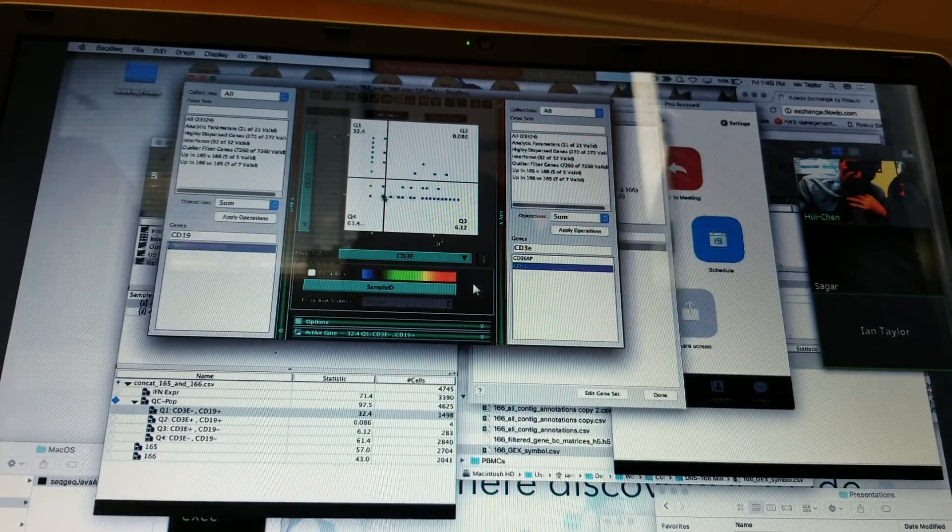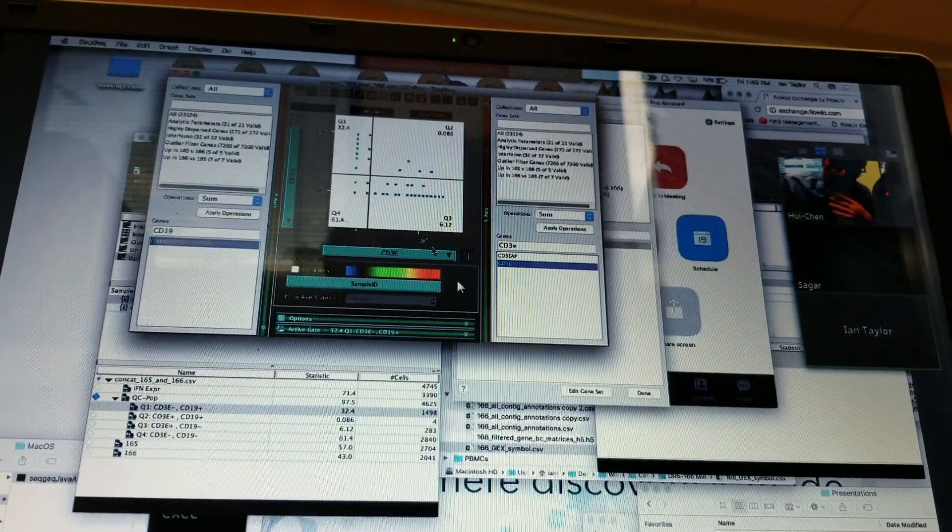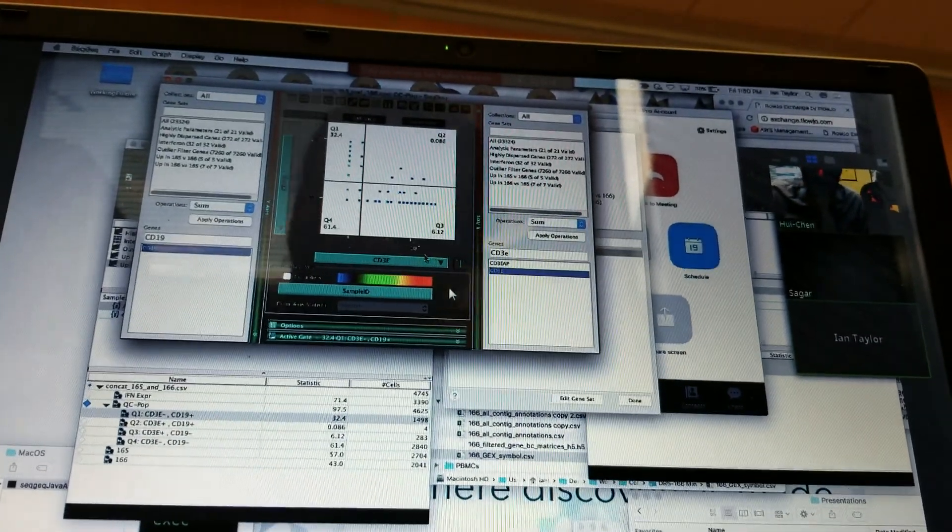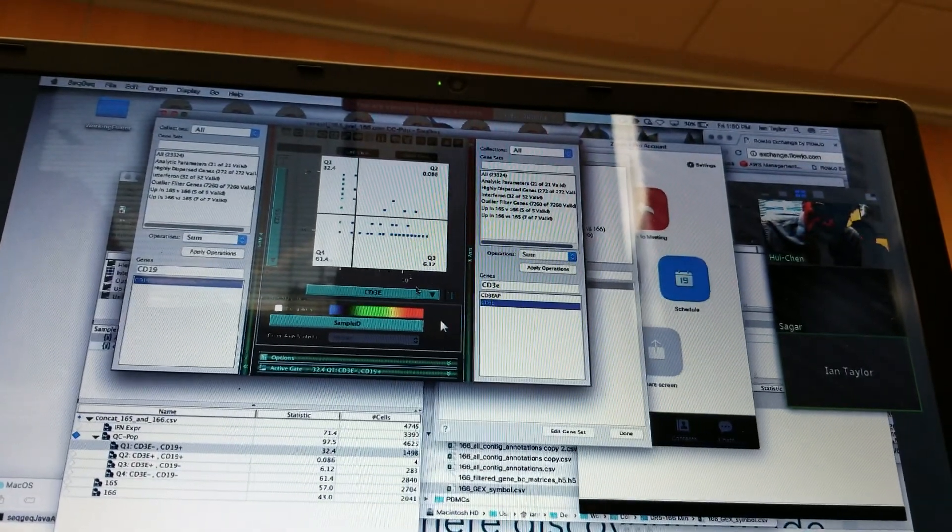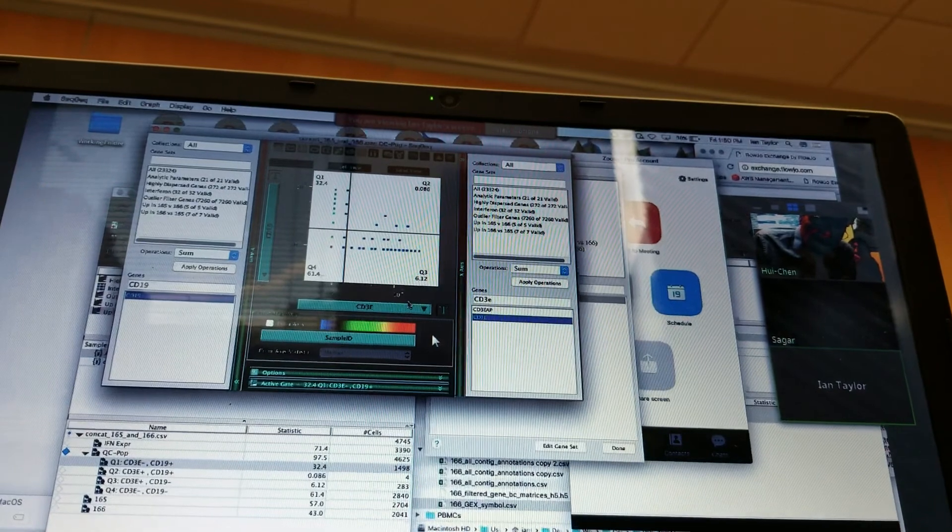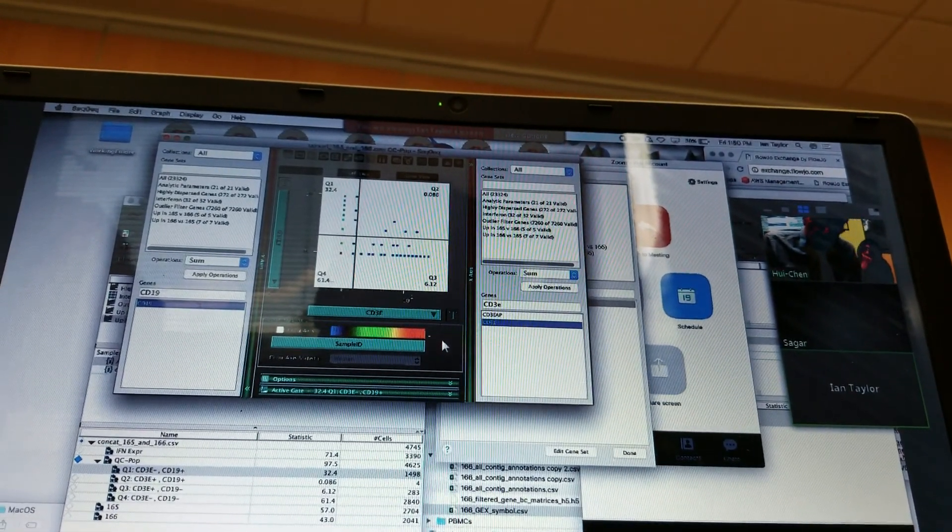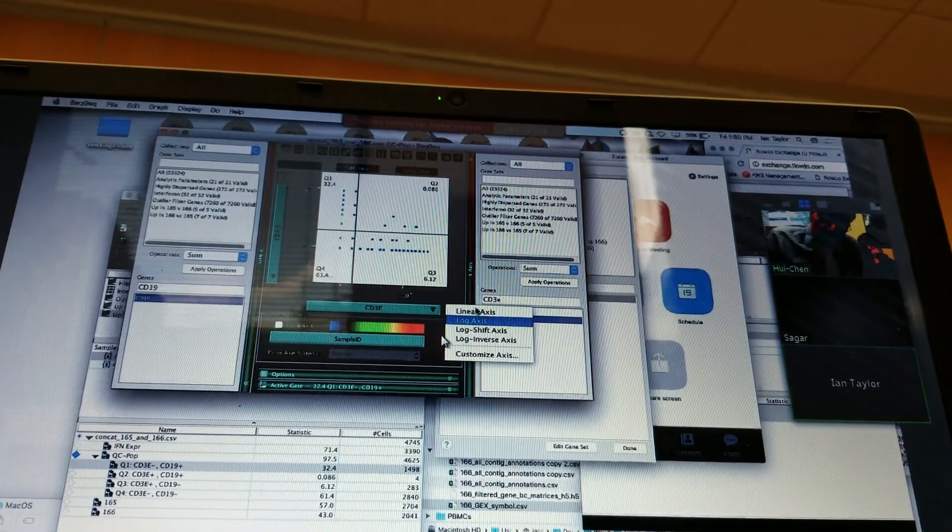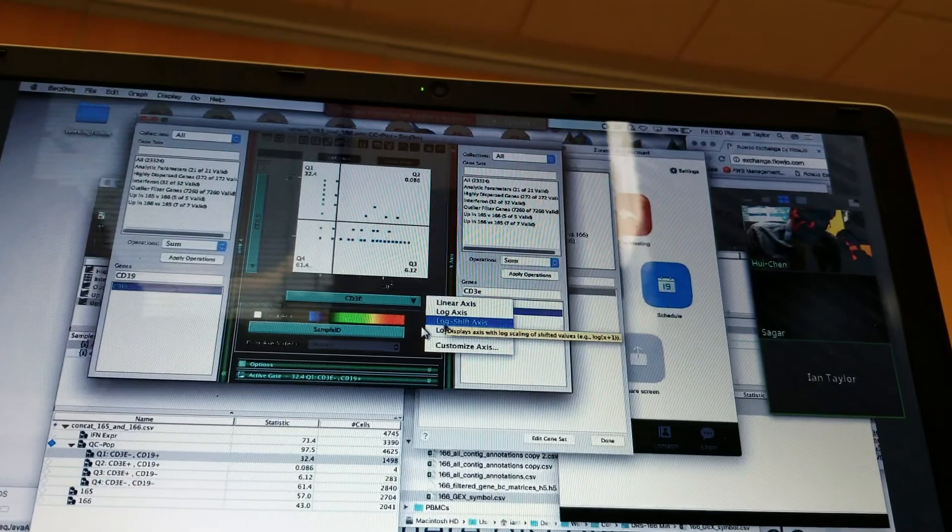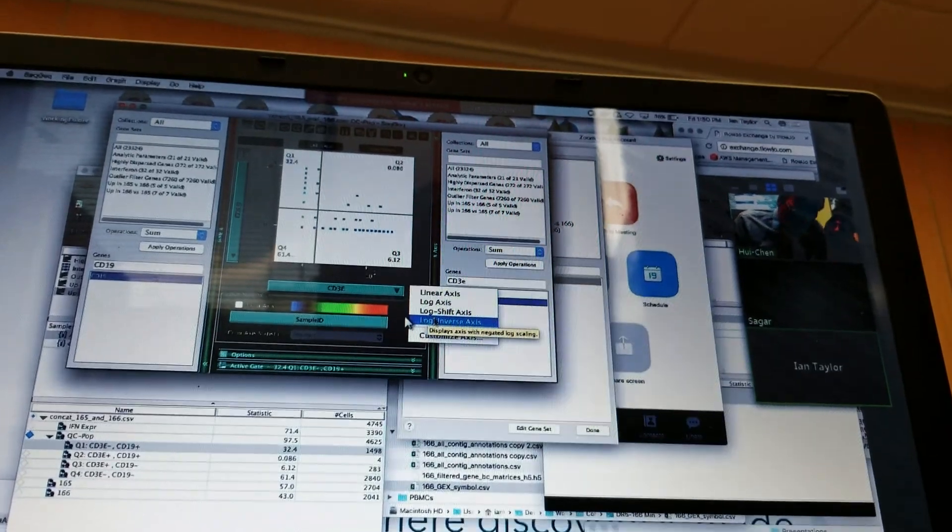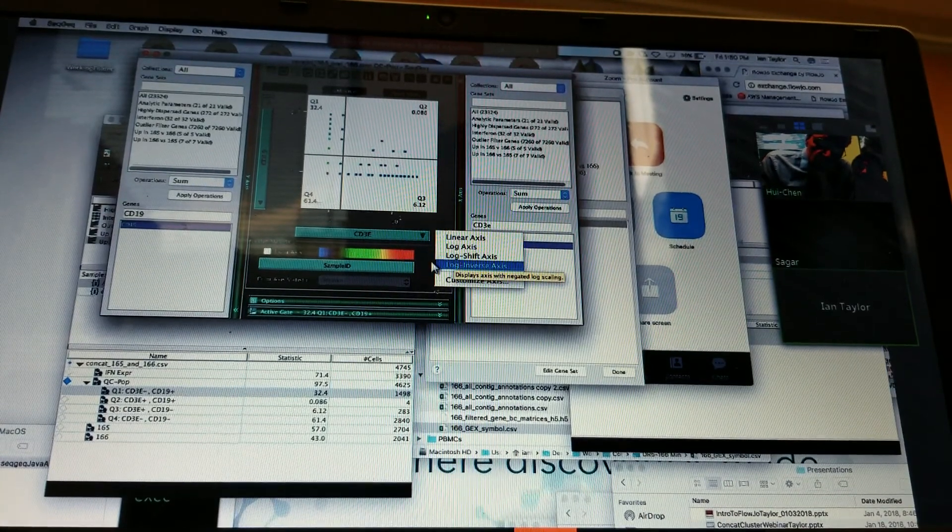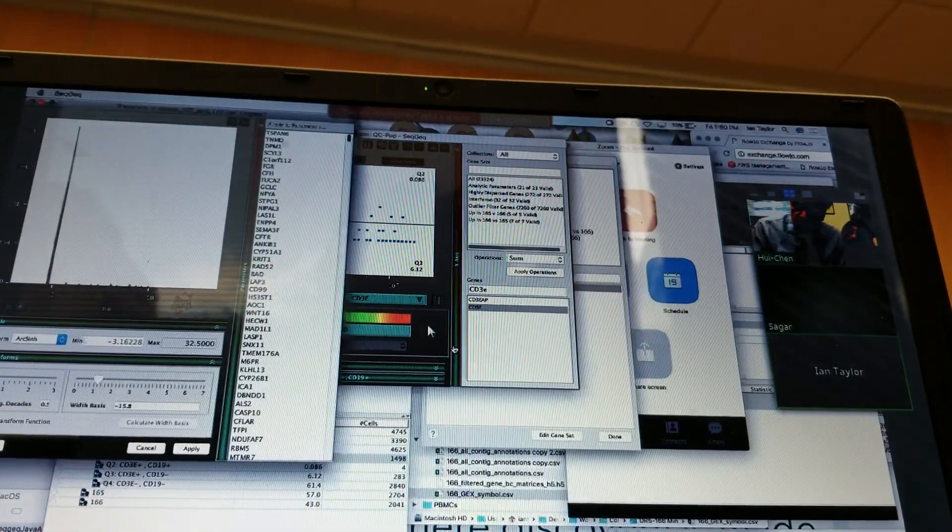Well, no, I was just saying in general, you know, you've got two axes, and I just don't know how to manipulate these axes. So, for example, if you go to CD3Epsilon, what choices do you have to make the axis look, or the dots or plot look like what you want? Yeah, so of course, CD3E, we're talking about the x-axis in this case. If you click on this T button. Oh, the T button, right. And that's the default.